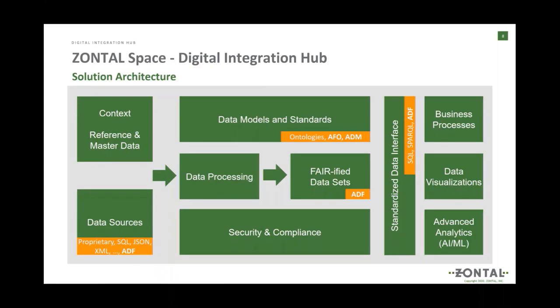And we also create data models here following the Allotrope design patterns. In the example that we will show today in the live demo, this is a stability and release data model that we have created here. All this FAIR data that we're collecting is then exposed via standardized interfaces, which makes it really easy for data scientists to consume those data sets. So we provide SQL, SPARQL, and ADF as interfaces here.